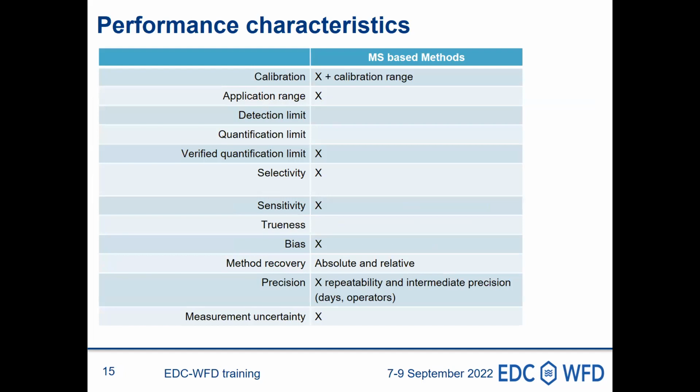What are the performance characteristics we have addressed? Calibration range, verified quantification limit, selectivity, sensitivity, bias, method recovery, absolute and relative, precision, repeatability and intermediate precision, considering days and operators, and of course, measurement uncertainty.